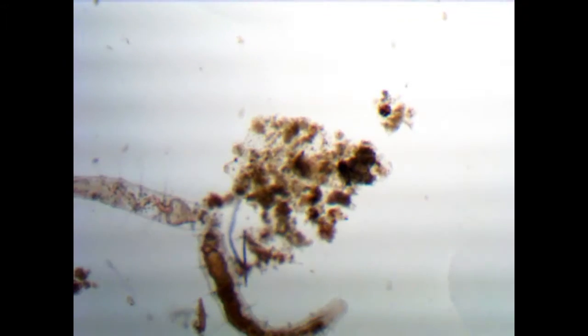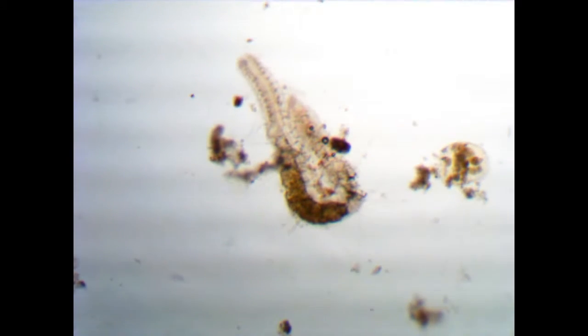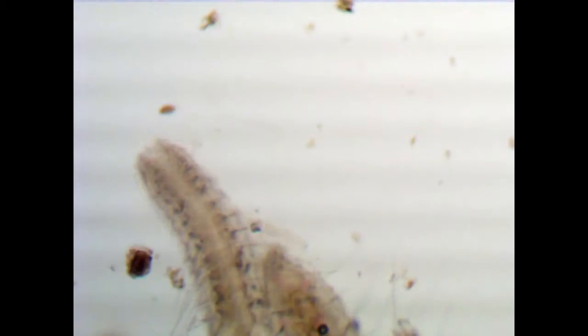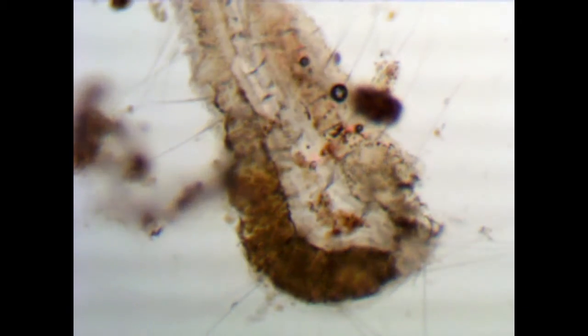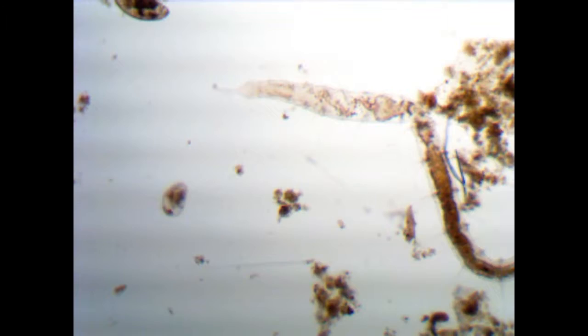Like I said, I'm more confident about the identification for D. fricardus like this because its features are a little bit more unique. I think this is a molt, perhaps, or maybe just a dead organism. But here we can see that the hairs are much longer. The gut or the intestinal tract looks a lot different. It's kind of got a funnel, if you can see, or maybe that's a heart, I don't know. But it has a long, sort of spiral, maybe esophagus, and then it funnels into the stomach, which funnels into what I assume to be the intestines.